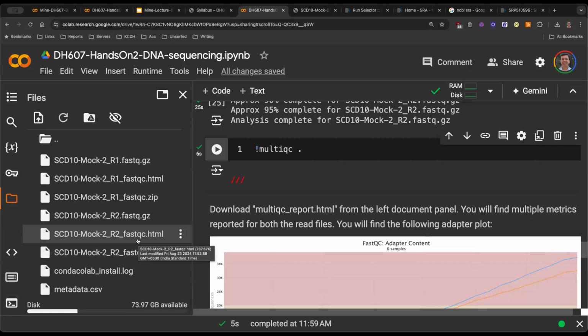You're doing this at the flow cell at the spot level. There are multiple copies of the read sitting there, because if you don't have this copy, your camera will have to be extra sensitive to detect what fluorophore was in it. But this solves the problem of cluster ambiguity.